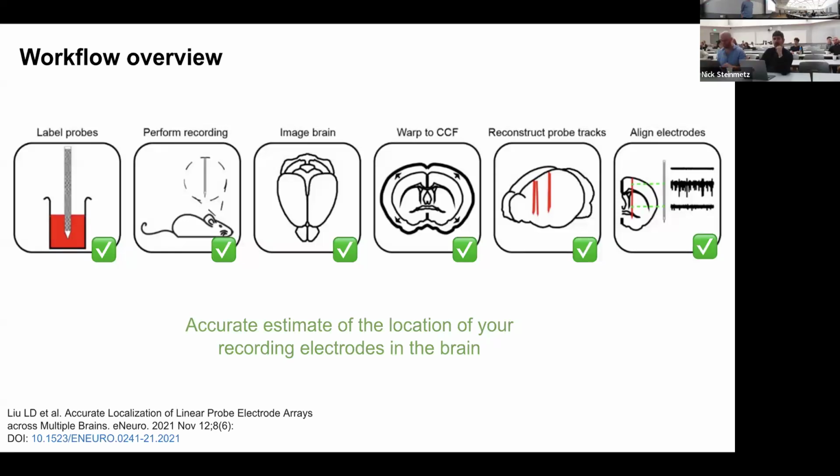There's also something that both the Allen Institute and we do, in slightly different versions. If you're using the 4-shank probes and recording from the deepest sites, that only gives you a really small window into the electrophysiological features. Ideally, you'd like to see a long stretch of features along your probe so you can see where all the transitions between brain regions are.